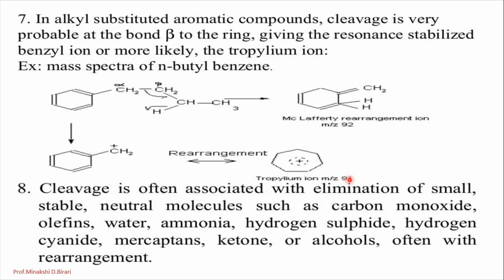So this will be the McLafferty rearrangement ion, and due to the formation of such an ion, a peak is also observed at M by Z 92. We have to study in detail about the McLafferty rearrangement in the next lectures. Okay, so this is important for alkyl substituted aromatic compounds.